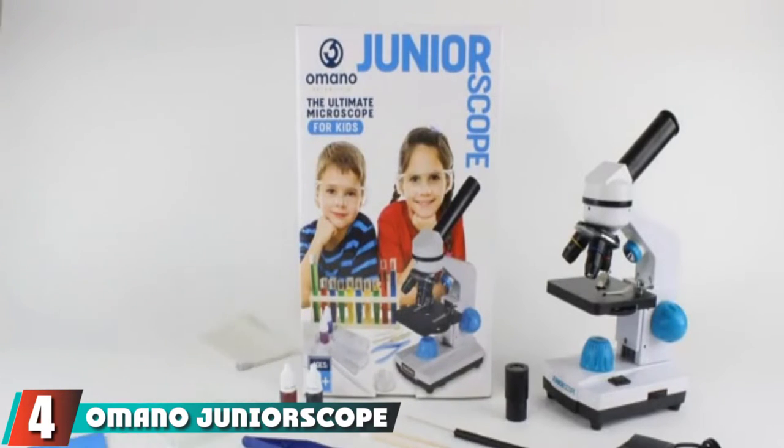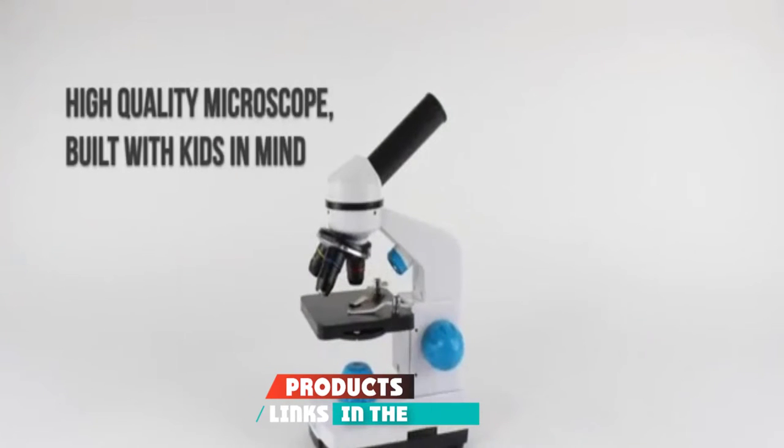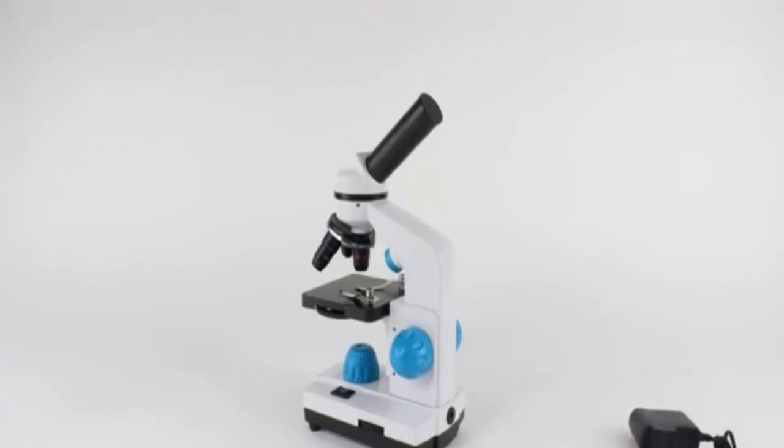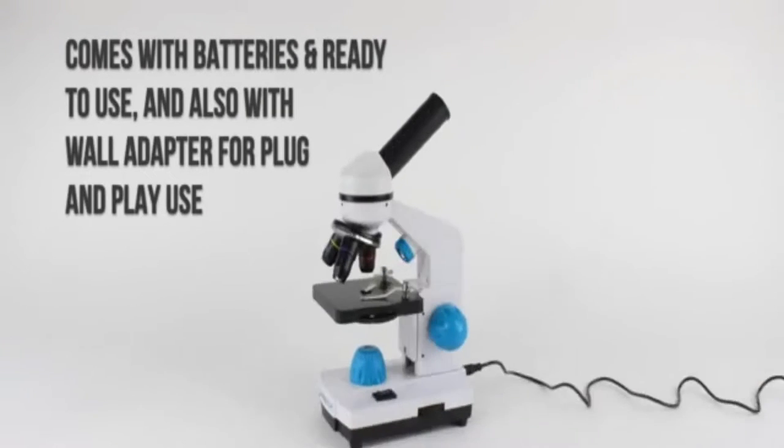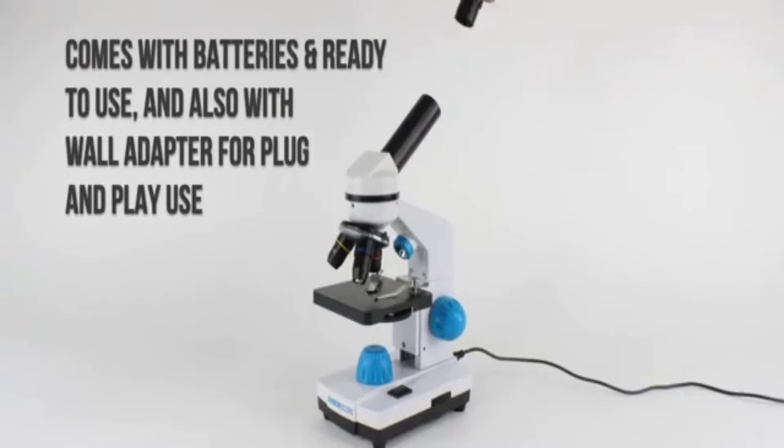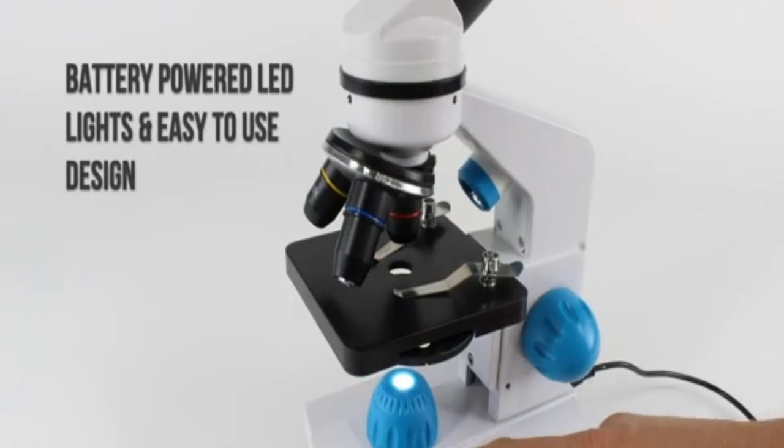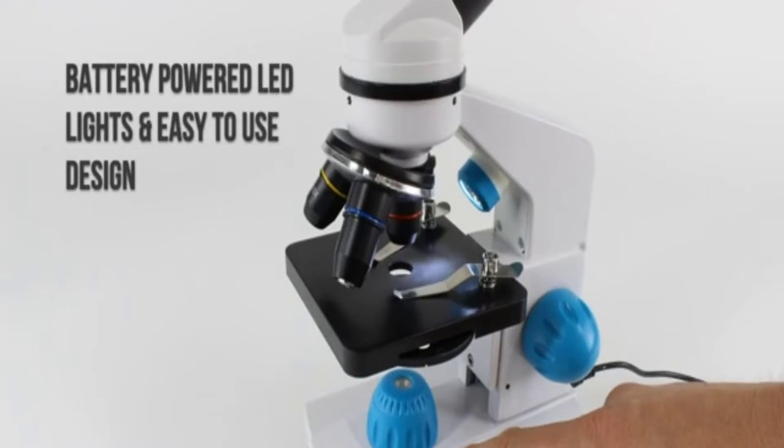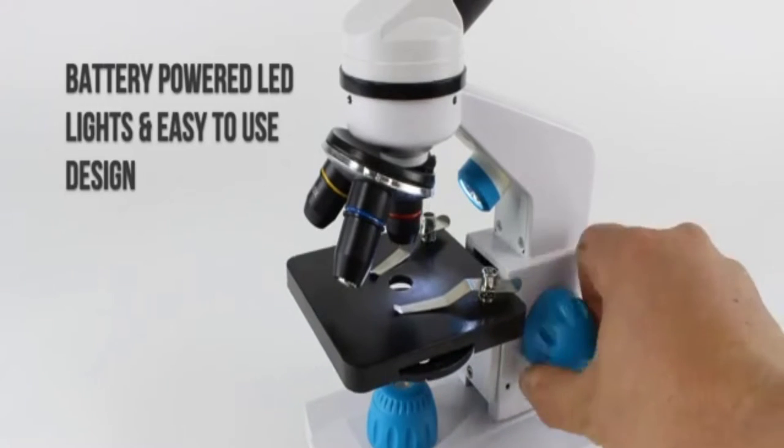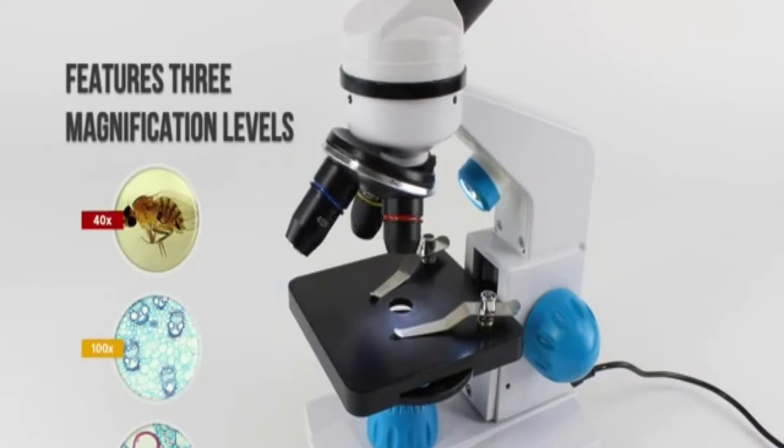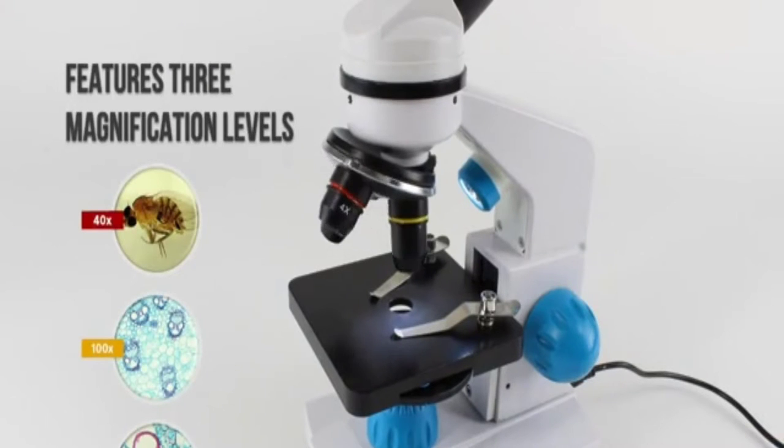Amano's is the best microscope for kids in the tabletop category for elementary students. Although it captures the looks and feels of one, this microscope is not overwhelming to use. The brightly colored body is a gentle reminder that this is still made for children, making it a great choice to develop your child's love for science at an early stage. The objective lenses can be adjusted for three magnifications: 40x, 100x, and 400x, which is acceptable enough for young audiences.